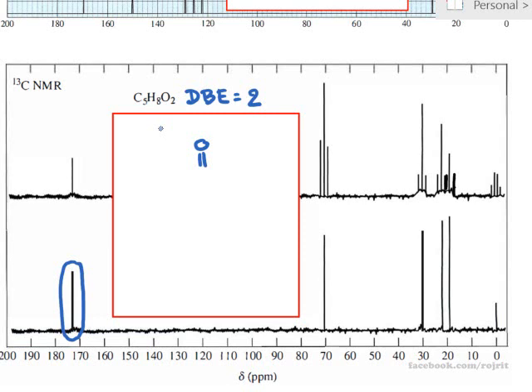So what else can we do? If you look at the splitting pattern, all of these are triplet, triplet, triplet, and triplet. Everywhere is a triplet. So you have only CH2, right, to be a triplet. All of these are CH2.